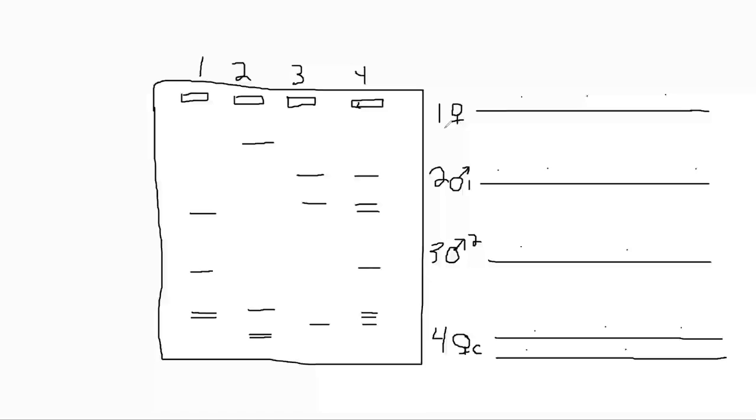Two chromosomes. Okay, so let's say we take some enzymes that cut DNA in very specific places. They recognize specific sequences. So we digest or break up the DNA using that enzyme. And for the woman, let's say we have cuts here, here, and here. That gives us now, instead of one long chromosome, 4 segments. And if we run that through a gel, we should get 4 bands. And so that's what we've gotten here. We've gotten 4 bands that have separated based on size.